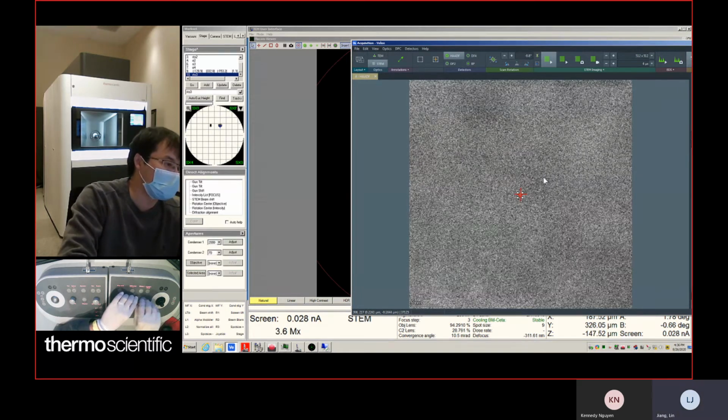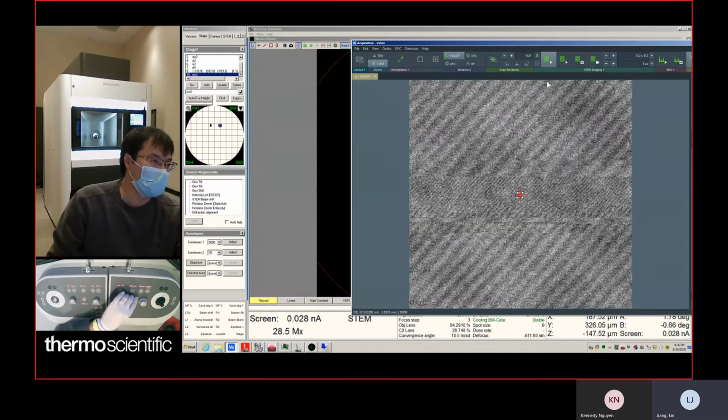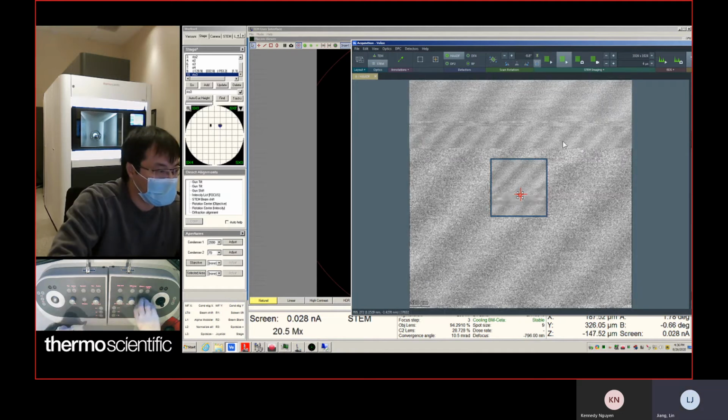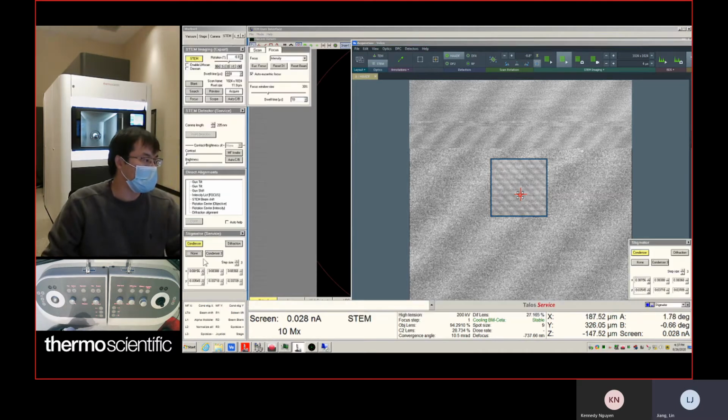Then we go to at least 3 million. Now we are close. Then do fine adjustment of your condenser.